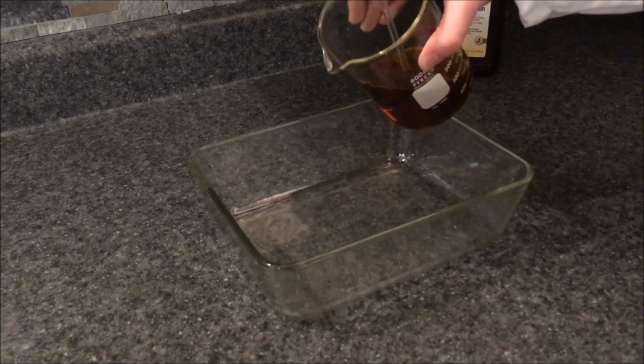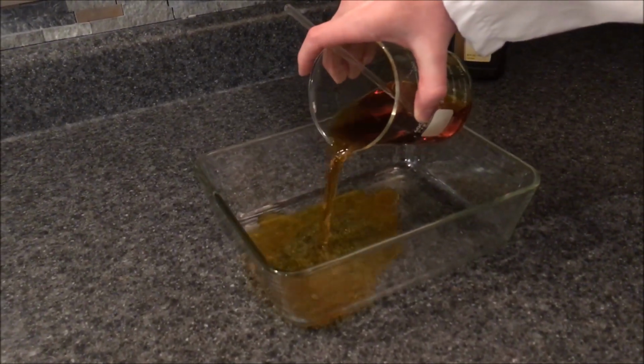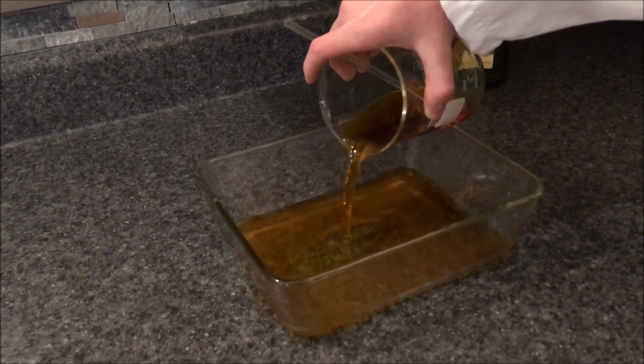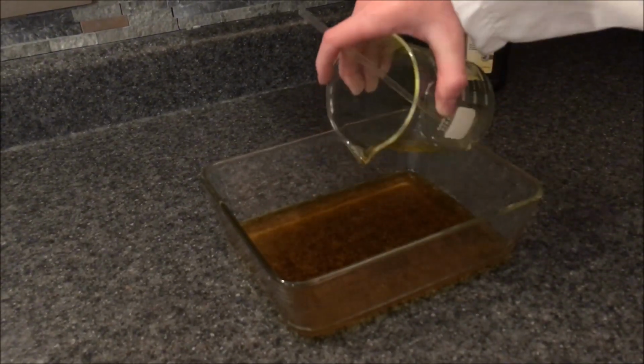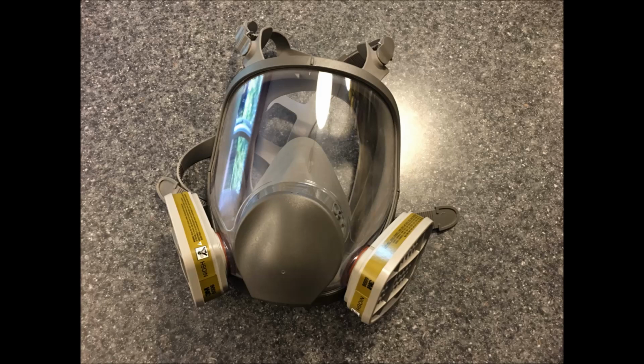You can then pour the solution into a container that has more surface area so that the water will evaporate faster. You can let it air dry or you can put it on a hot plate and then in an oven so that the water will evaporate faster. If you heat the solution, make sure you have a good gas mask because small amounts of hydrochloric acid will come off.